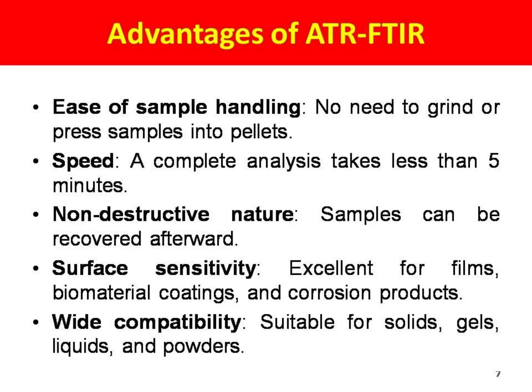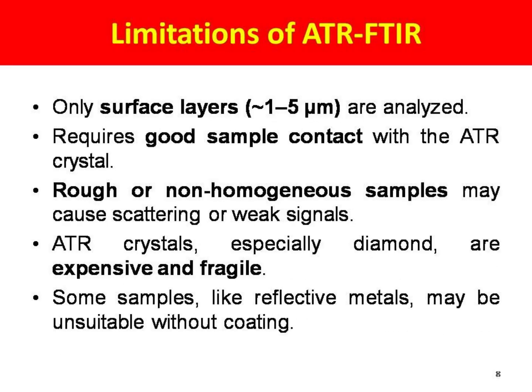It's a non-destructive method, that is, samples can be recovered afterward. The surface sensitivity is excellent, especially for films, biomaterial coatings and corrosion products. Wide compatibility, that is, suitable for solids, gels, liquids and powders.